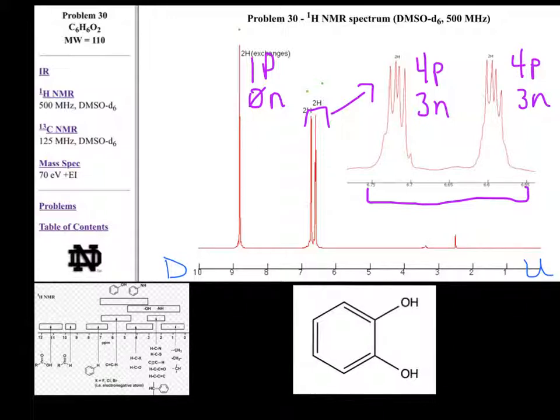These 2 hydrogen groups are going to be found close together on the structure, and this group to the left is going to experience a little bit more de-shielding than the group on the right. So let's compare our structure to the signals that we see on the NMR spectra. We see that we do have 3 different types of hydrogens in 3 different environments.